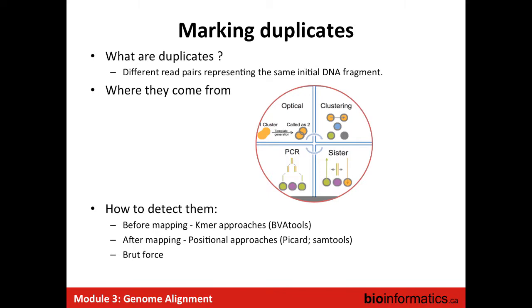Because if you have a discrepancy, but you know the quality is lower, it is more likely that these other reads bring you an error. So that's why you remove them. You don't want to take them because you don't want to introduce the error they can contain. Does that make sense for you? I think I follow. Yes, thanks.